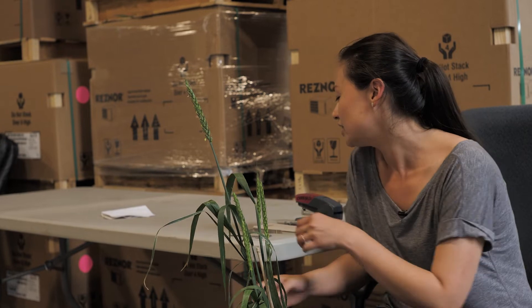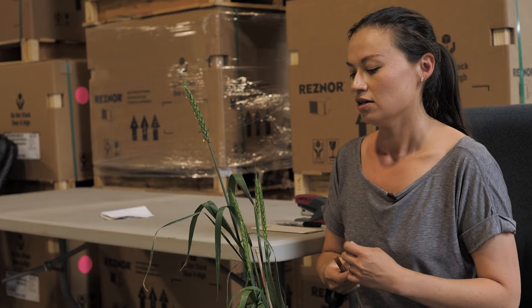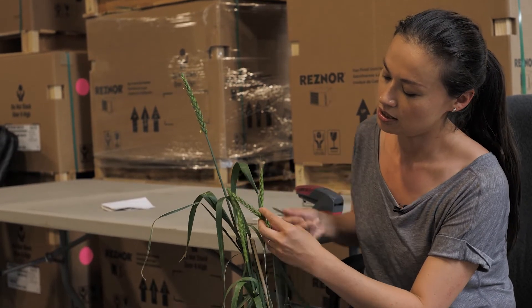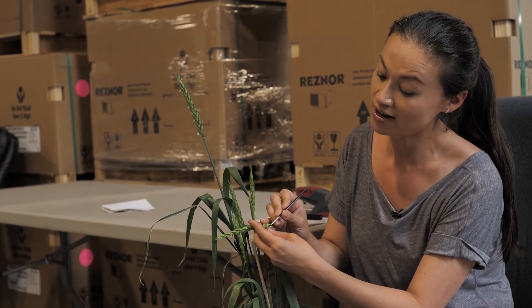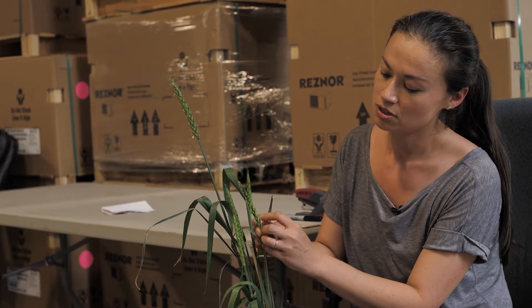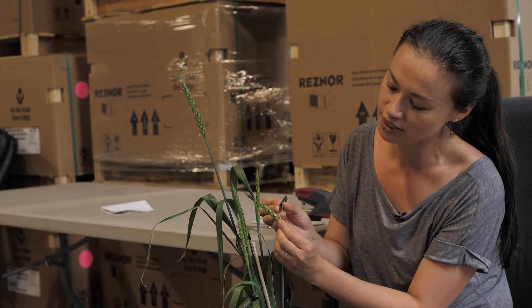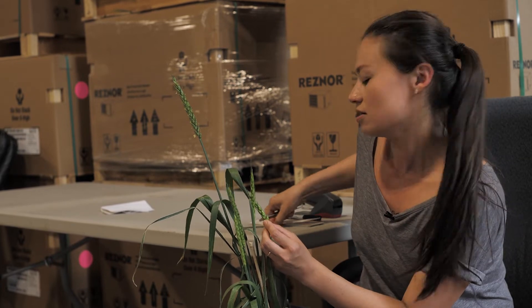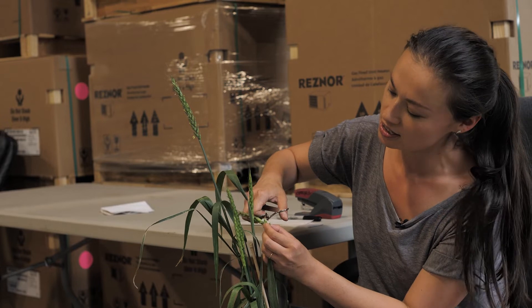For emasculation you need a tiny pair of scissors and very tiny forceps. First, you can pull out the middle floret just to make things easier. There are actually usually about three little flowers on a spikelet like this, so we like to pull out the middle one to make our lives easier.